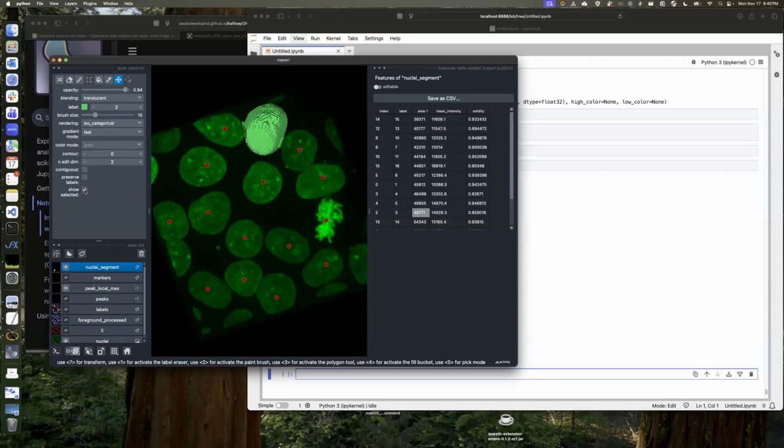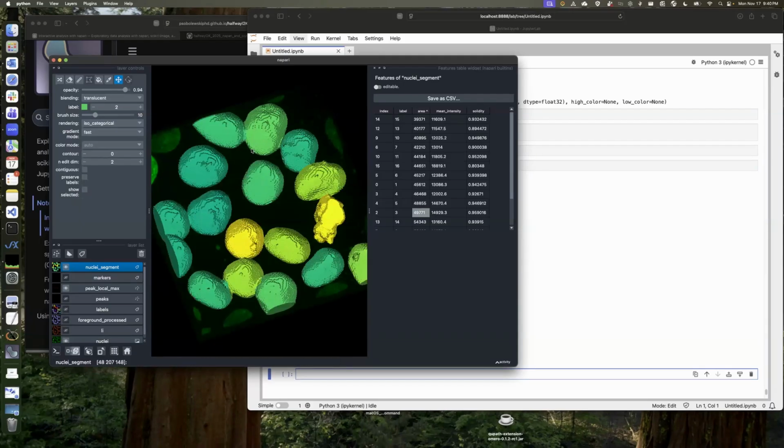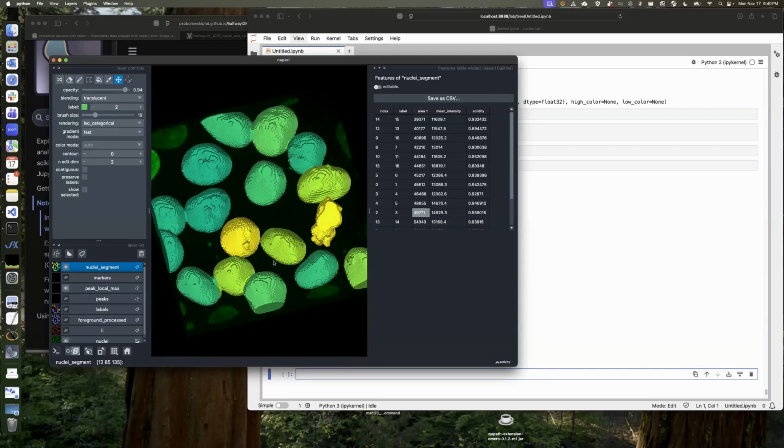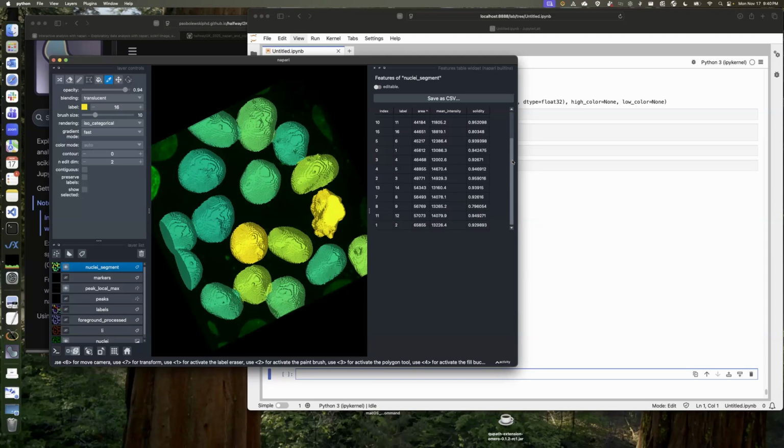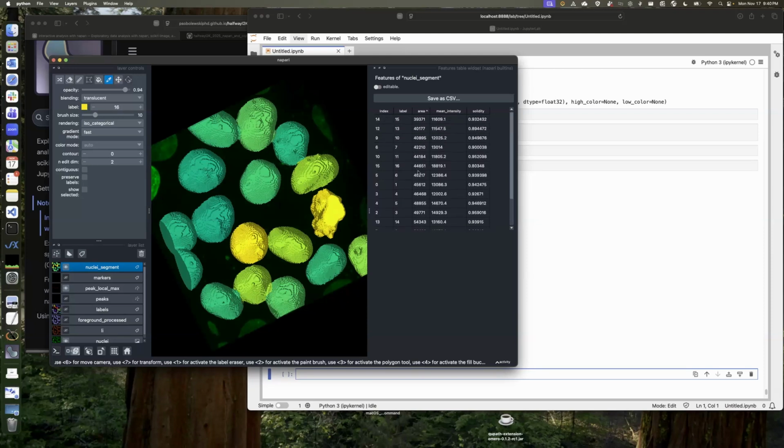And if you instead leave all of them, you can do this in the opposite direction. So which is this one, this yellow one? We can use the picker to select this label, and then it should, oh, it didn't work. Huh, interesting. So I would have expected it to be selected here, but it's not. But this is, so if I don't do that, right? If I hover over, oh, it doesn't have any properties.